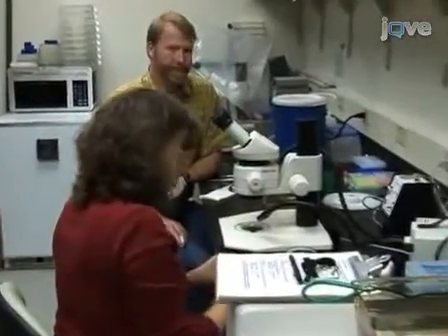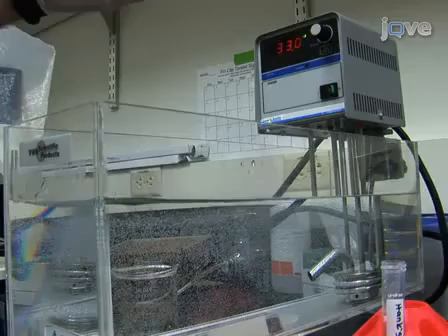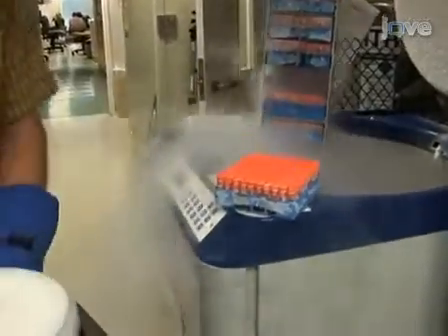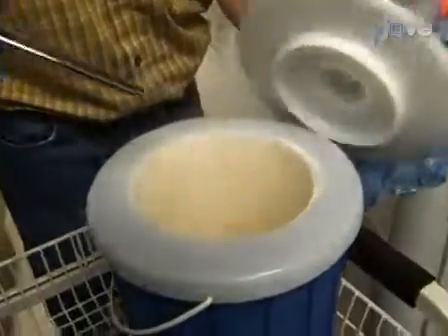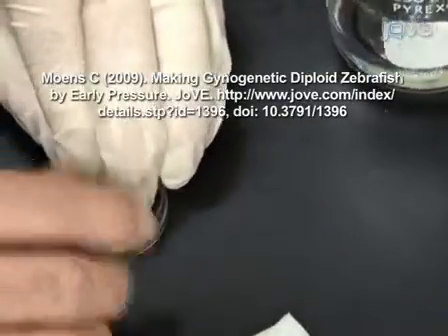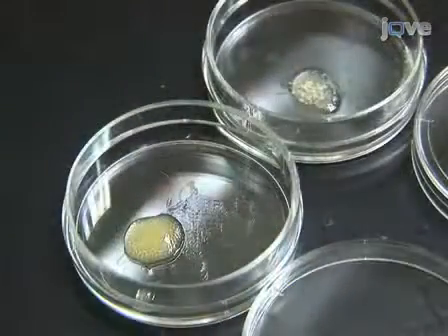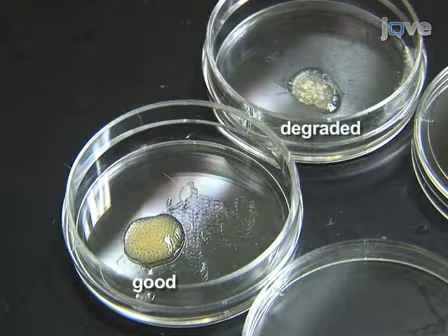In vitro fertilization using cryopreserved sperm works best with two people. One person squeezes eggs from the females while the other person thaws the sperm. Set a water bath to 33 degrees Celsius. Remove a cryovial from the liquid nitrogen freezer and transfer it to a liquid nitrogen-containing Dewar flask until it is ready to thaw. Squeeze eggs from anesthetized females into a 35-millimeter plastic petri dish. A good clutch contains more than 150 eggs that are uniform and yellowish; any white debris is indicative of degradation. If possible, try to obtain three clutches of eggs and combine into one dish. If three good clutches are not obtained within one minute of the first clutch, then proceed to the next step.